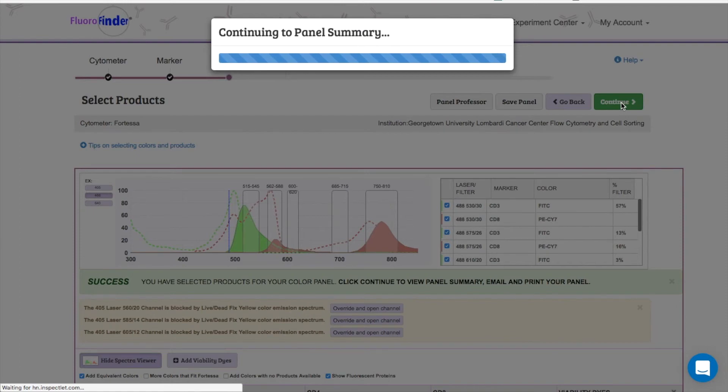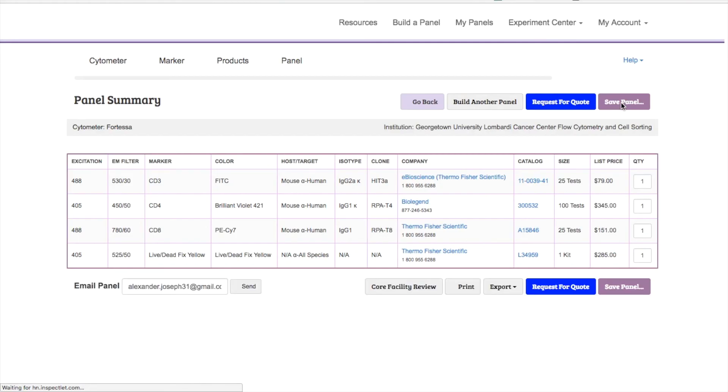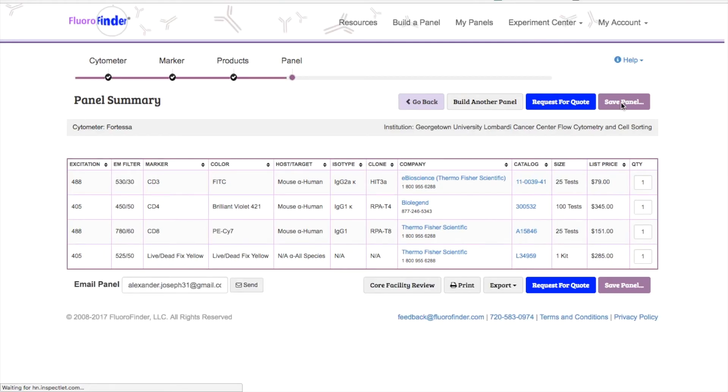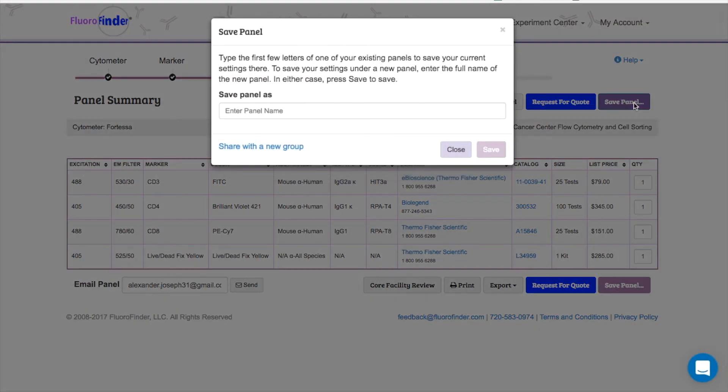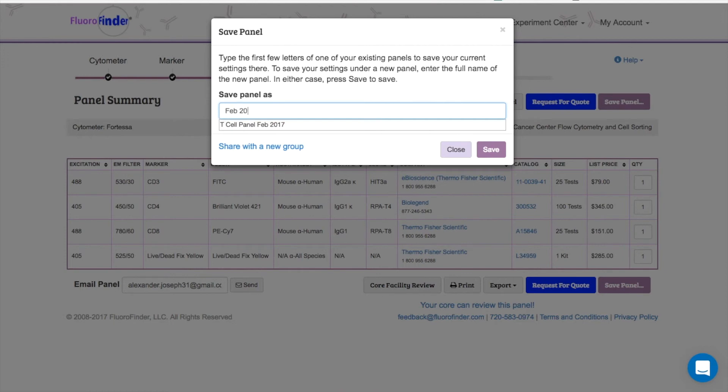The last step is the easiest. Here, you'll decide exactly what you want to do with your experiment. First and foremost, you should save your panel. This allows you to come back and see exactly what products you ordered, and to make edits to your panel in the future without having to start from scratch.